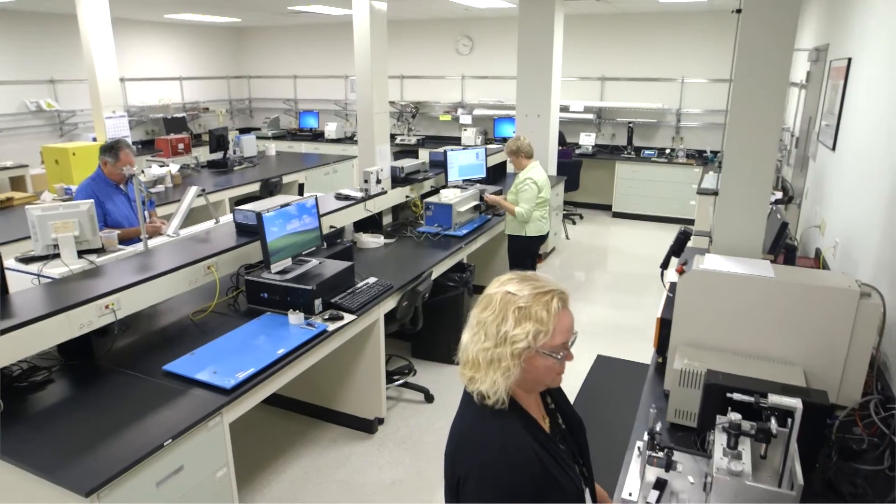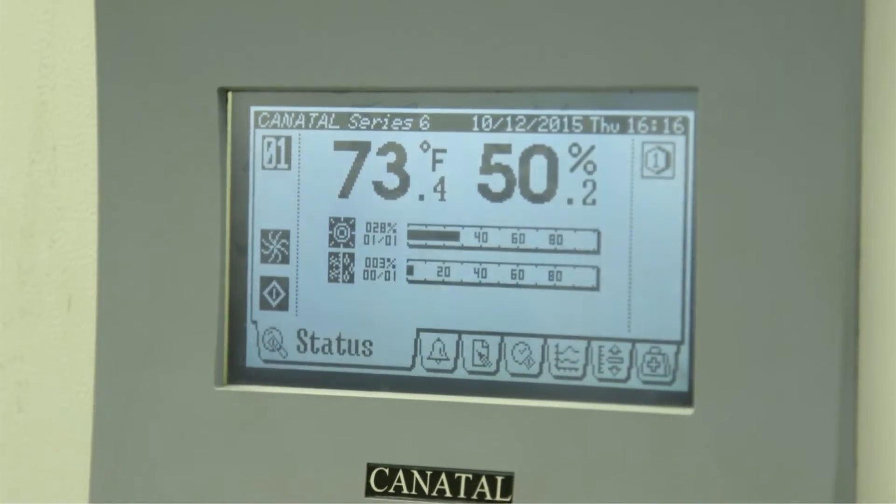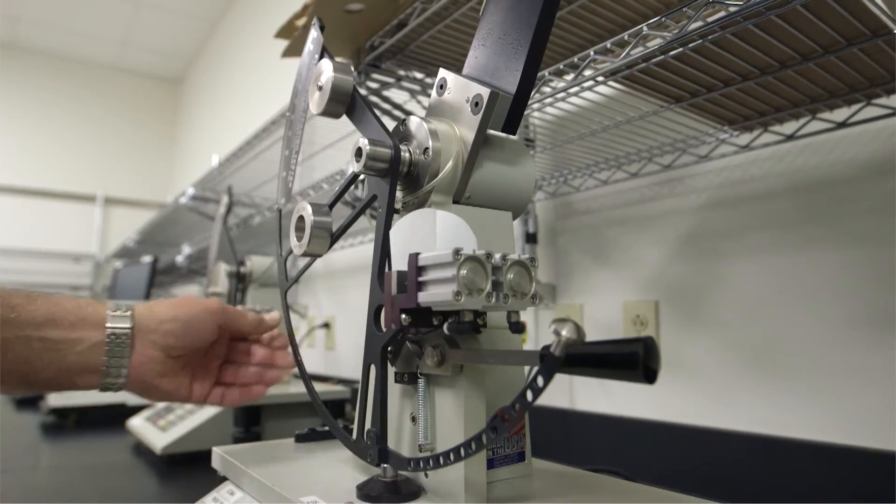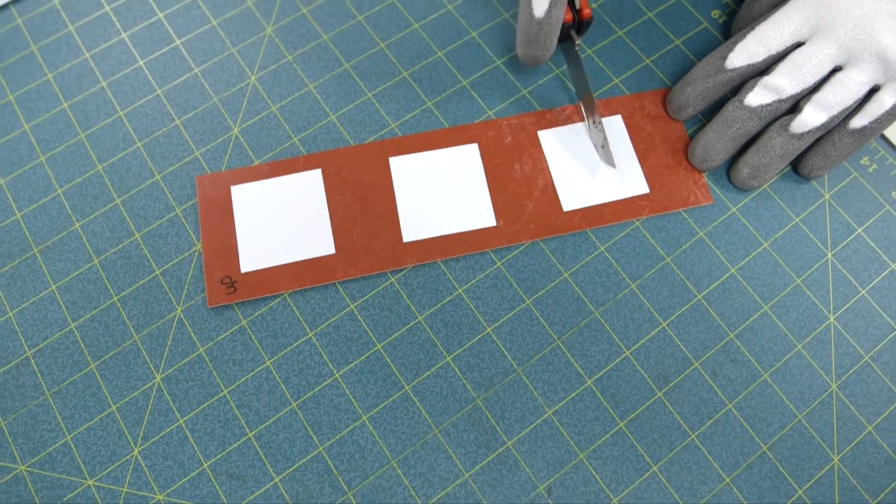In this area, we test all paper to TAPI standards, such as face stock properties, including color, opacity, brightness, and gloss.